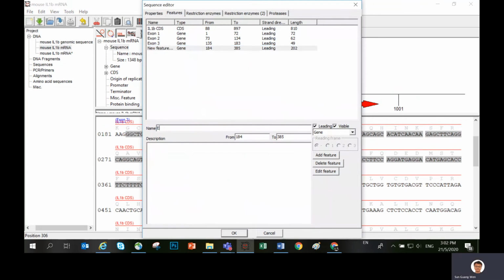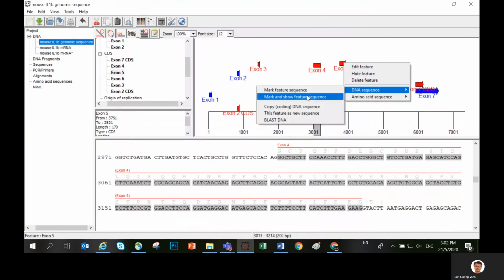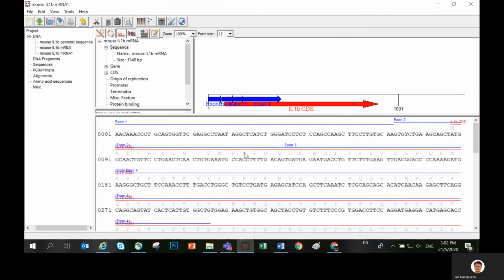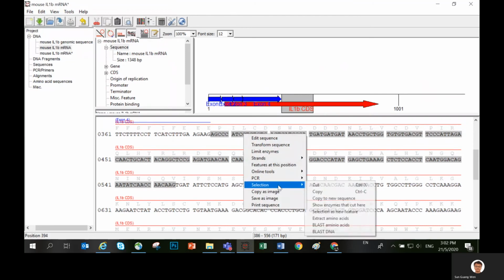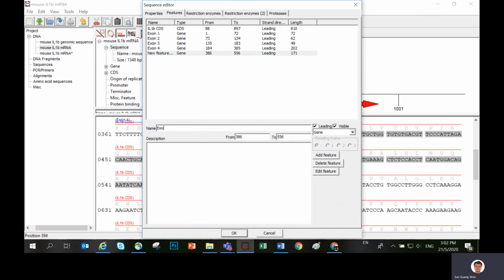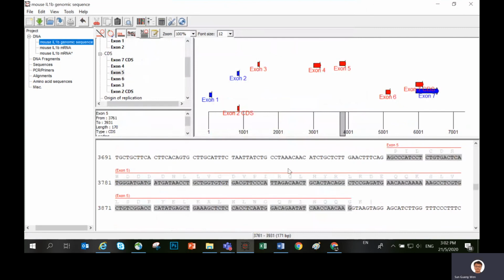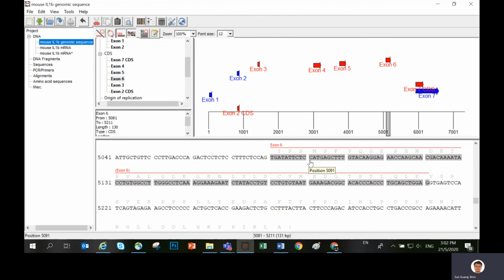This is exon 4. Exon 5. Make use of the shortcut keys; you make the work slightly faster because you do not need to find the keys.